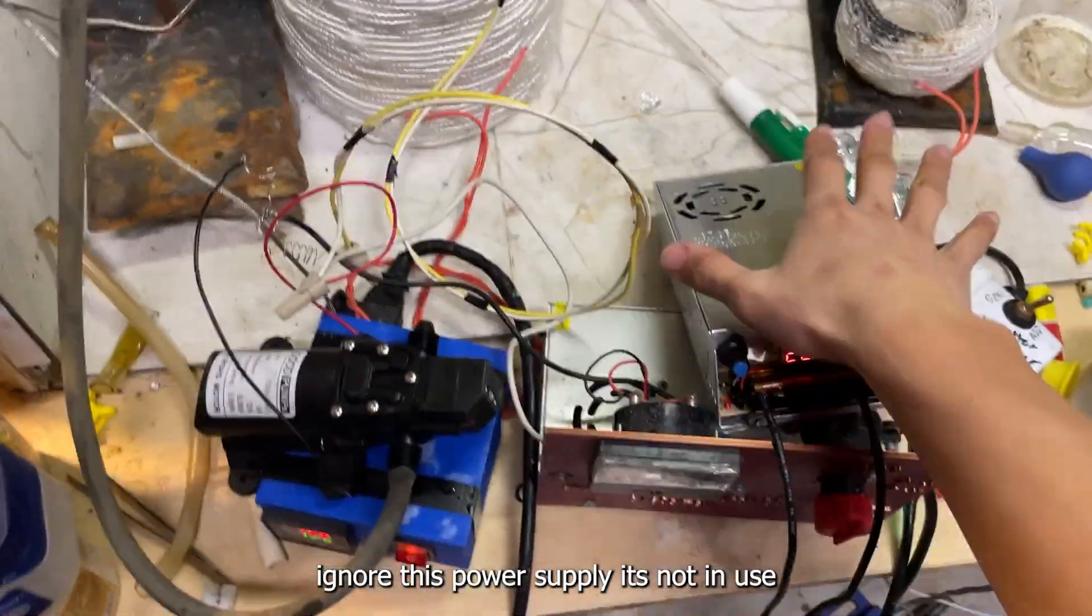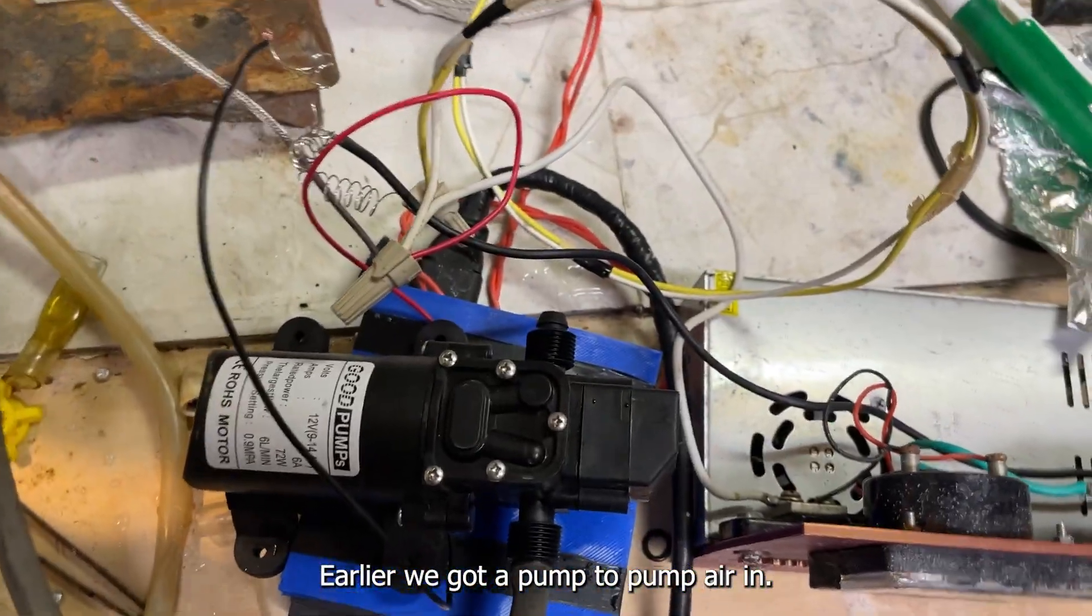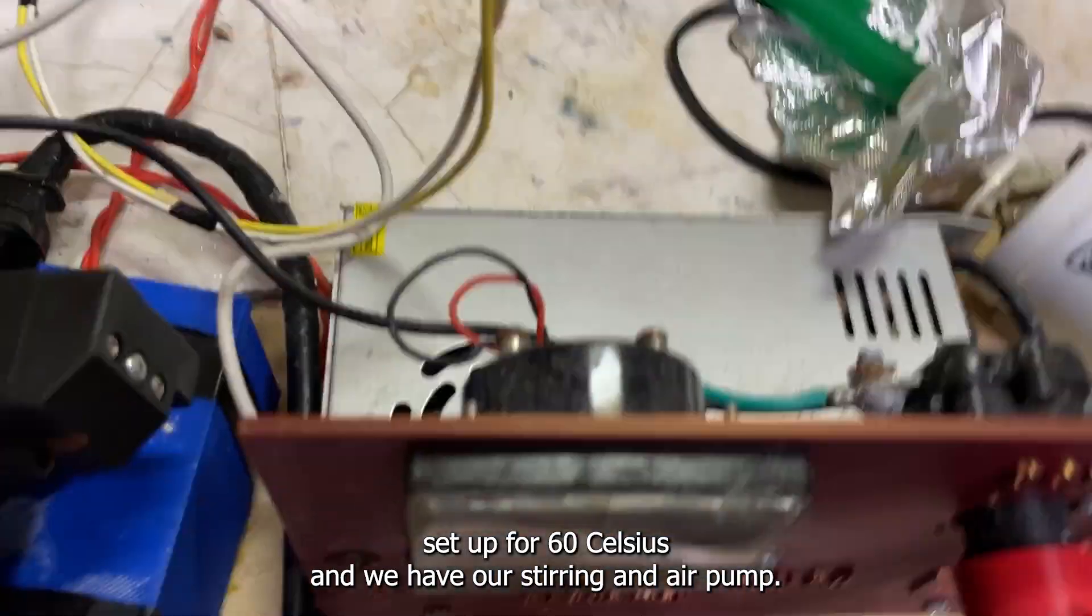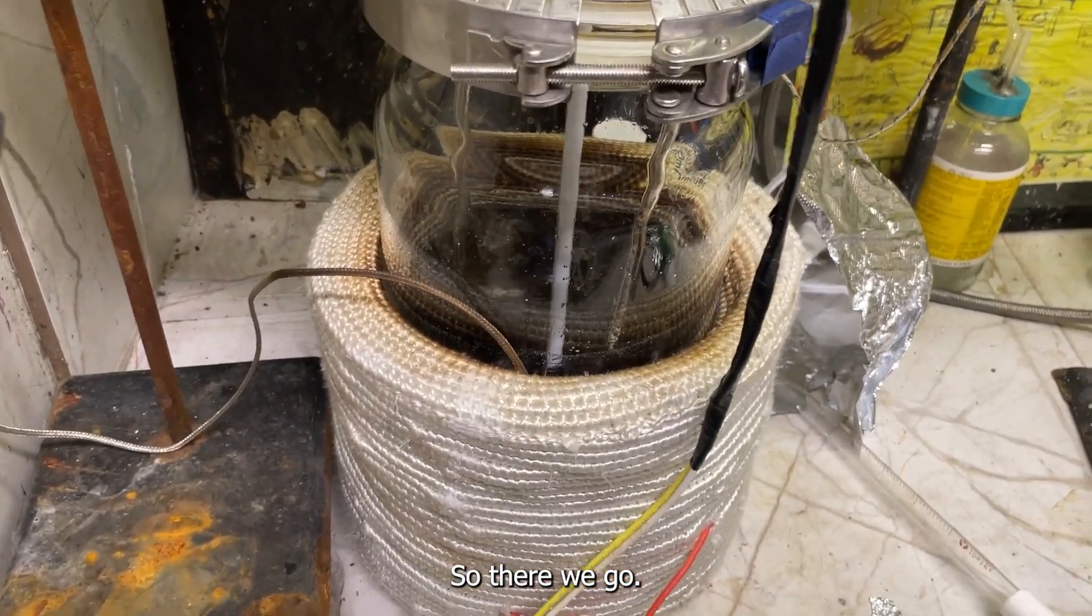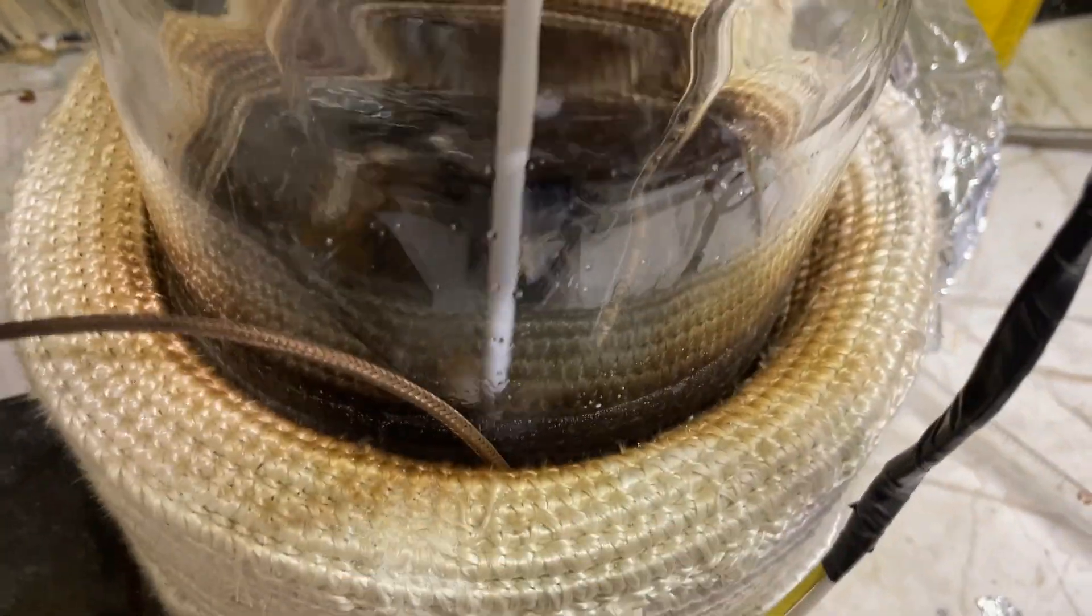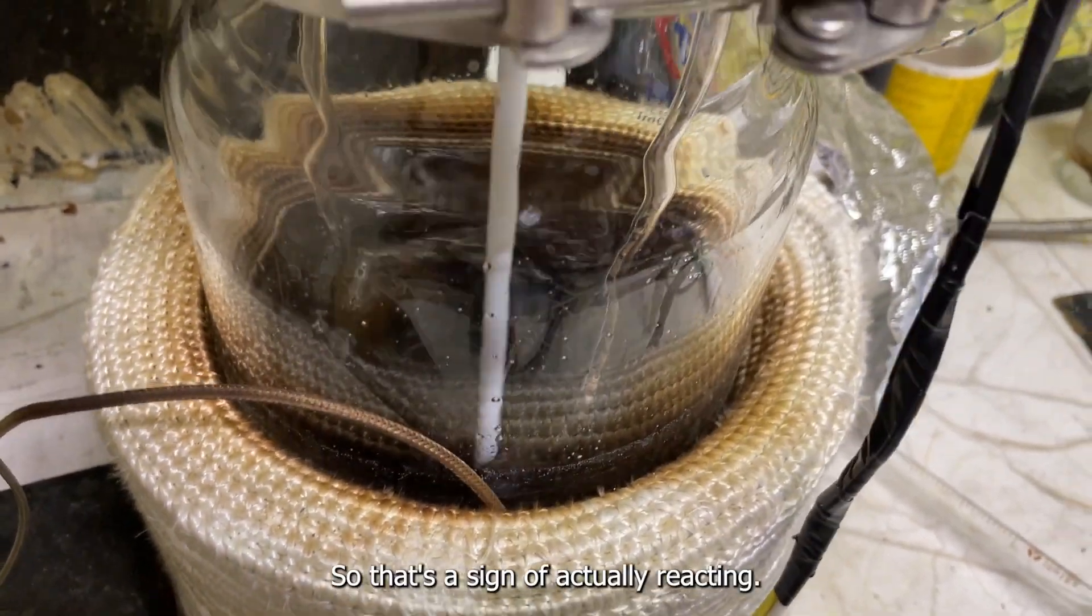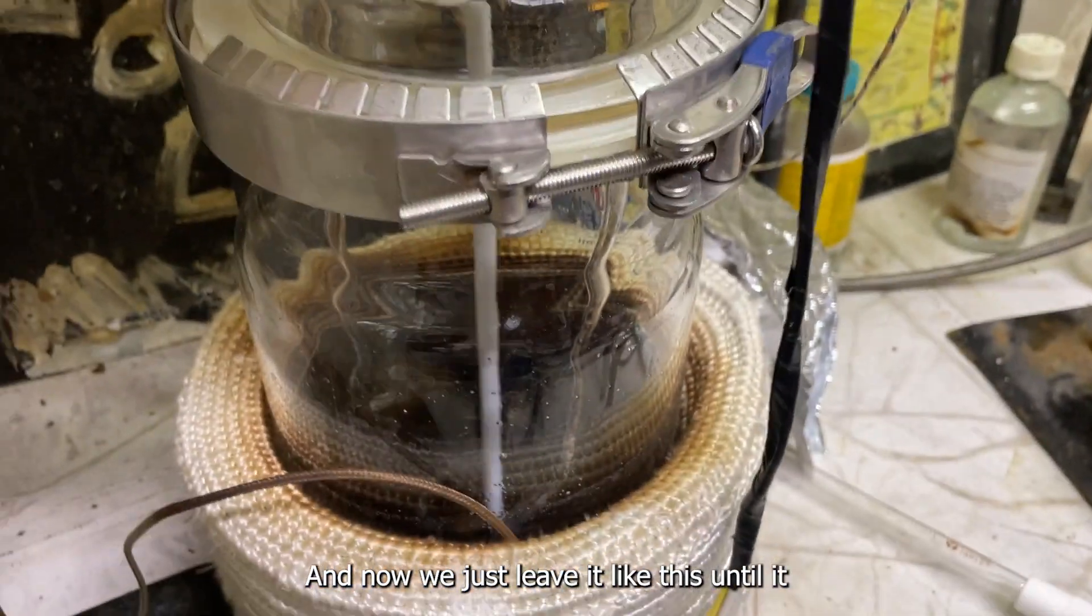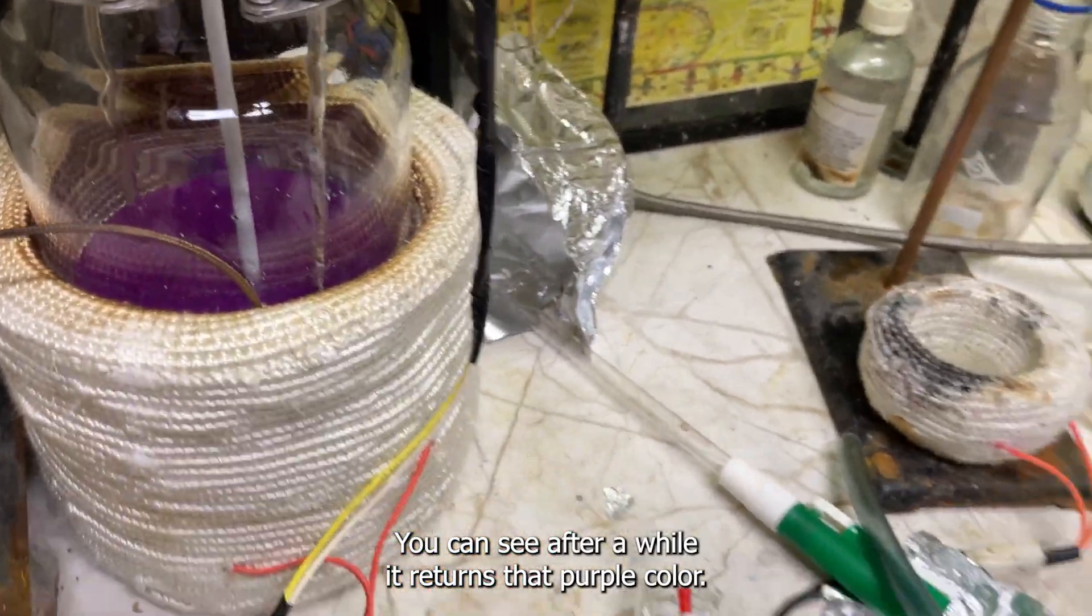Okay, secured the apparatus, ignore this power supply it's not in use. We got a pump to pump air in, we have our heating controller set up for 60 celsius, and we have our stirring and air pumps. You can see as I was setting up, I was letting it warm up, and you can see it change colors from that purplish color to this brownish color. That's a sign of it actually reacting. I would just leave it like this until it stops reacting, and after a while it returns to that purple color.